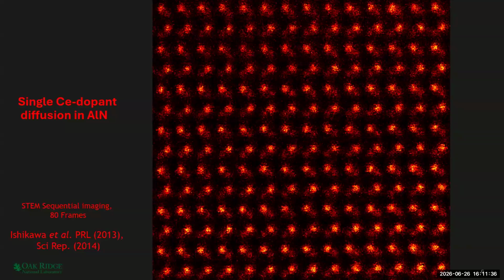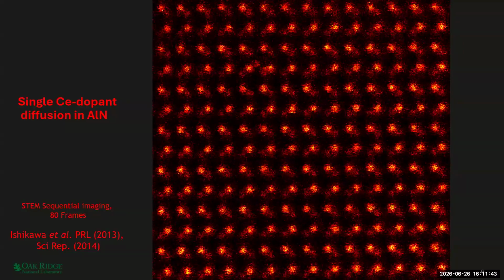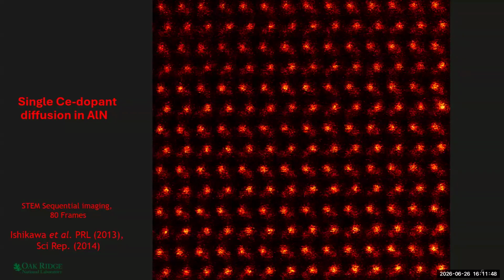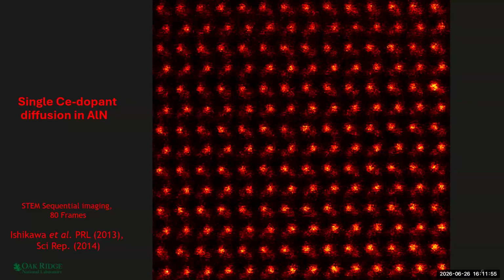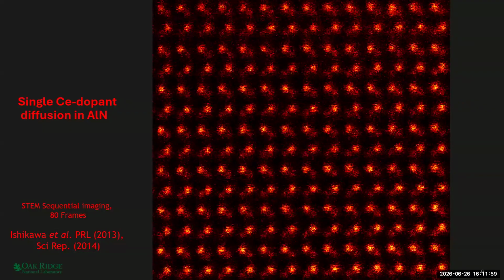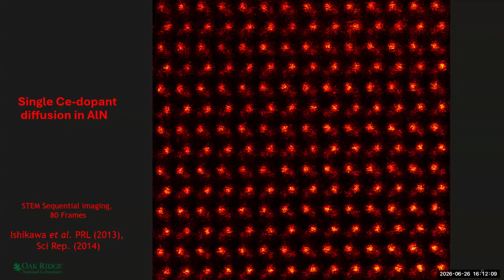And here's an example of this sort of process in a modern electron microscope. So here we weren't trying to control the atoms at all, unlike the previous talk. We were trying to get multiple images of the same sample to try and improve the statistics to figure out exactly what it was we were seeing. How many atoms are there in each column? What depth is this dopant inside the crystal? And when you start trying to do this, you see it moves around and it's jumping around. There's kind of a pattern to the movement as well.